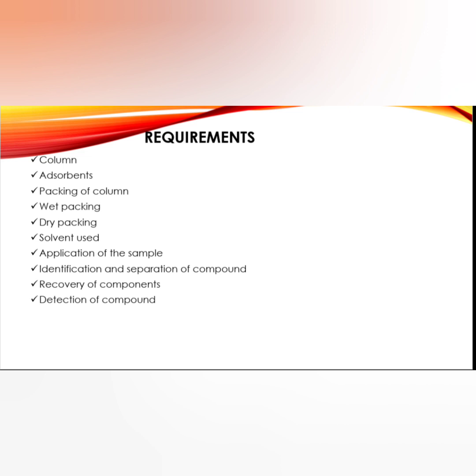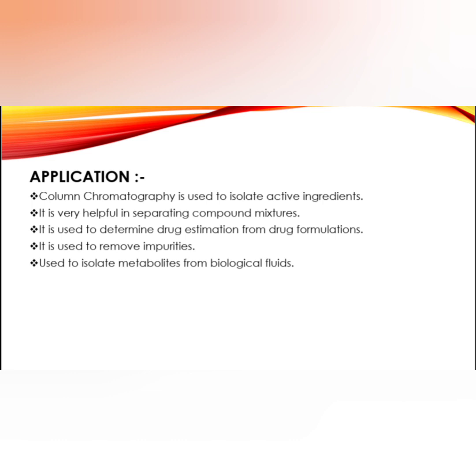And next one is applications. Column chromatography is used to isolate active ingredients. It is very helpful in separating compound mixtures. It is used to determine drug estimation from drug formulations. It is used to remove impurities, and it is used to isolate metabolites from biological fluids.